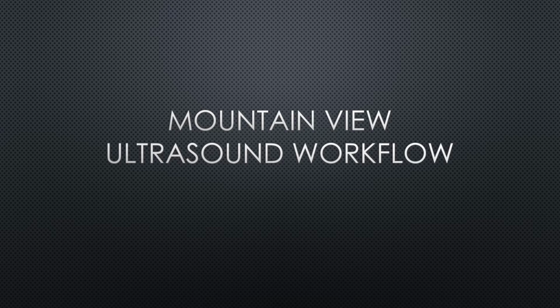So if you watched the other two videos, you'll have a good basic knowledge base on where to start with the machine, how it works, kind of things you might run into. If you are someone who's joining us that does not work at Mountain View, you're certainly welcome to watch this lecture as well. But this is our particular implementation, so this may not be as relevant to you.